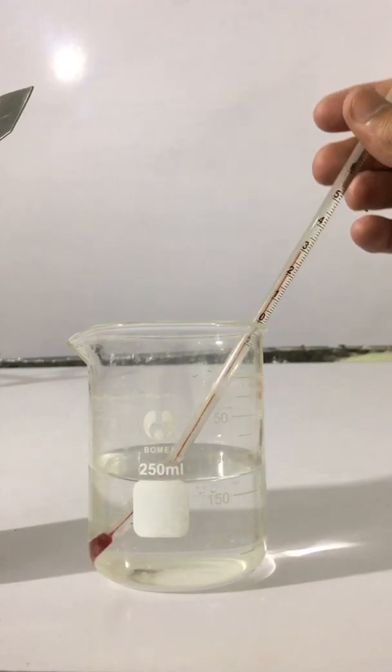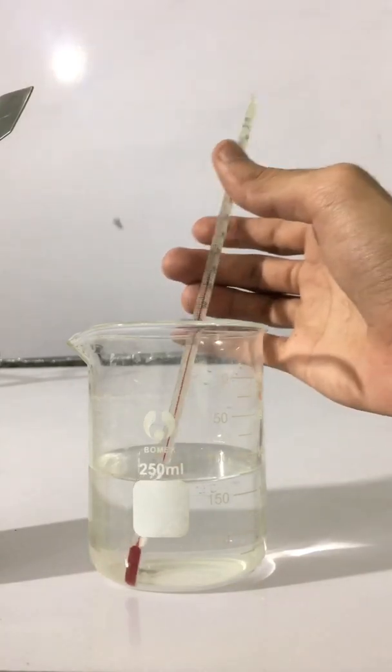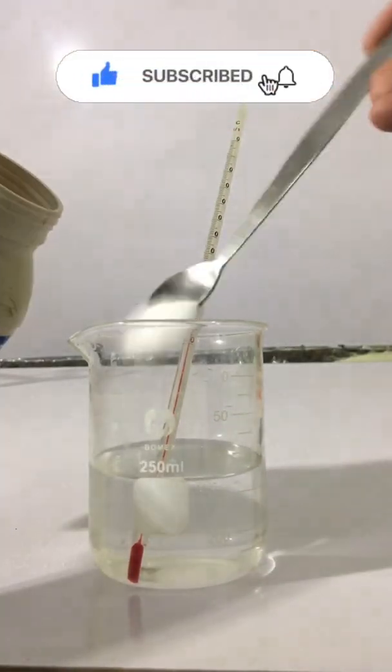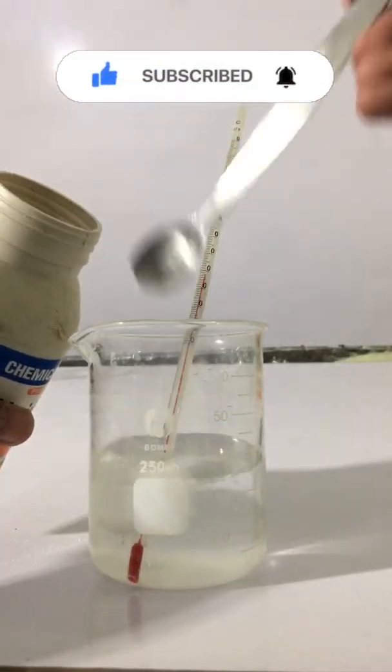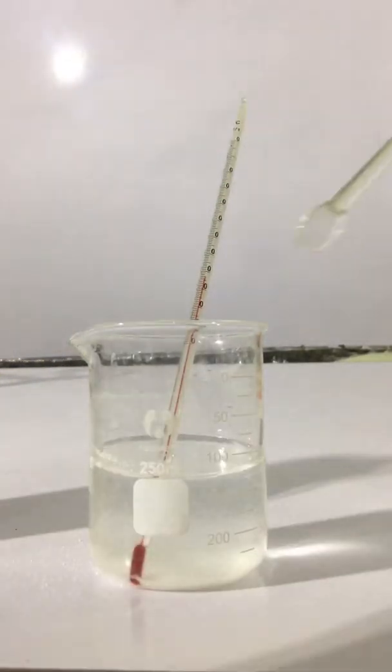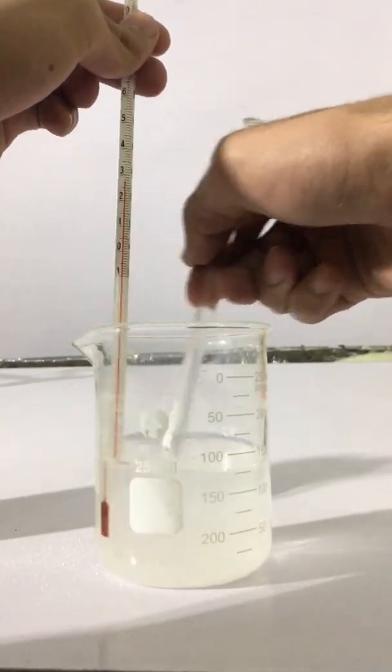After that, you have to add ammonium chloride to the beaker containing water. You will notice a decrease in temperature when the ammonium chloride is dissolved.